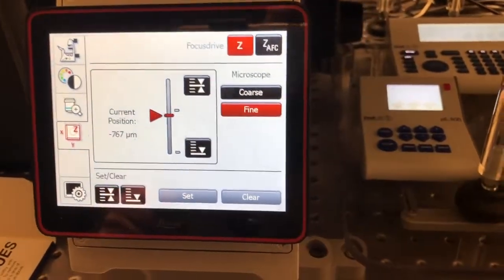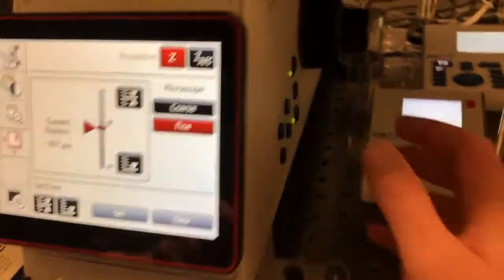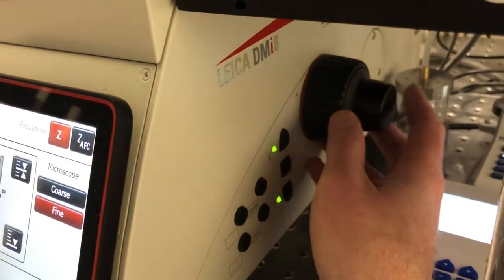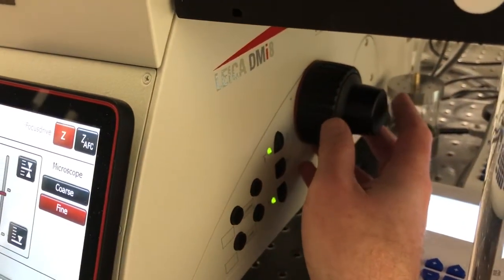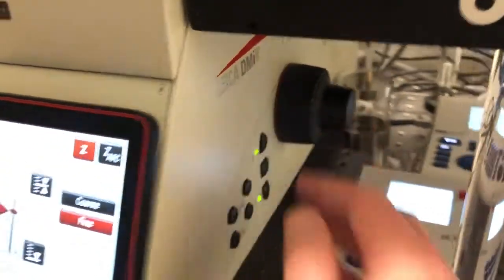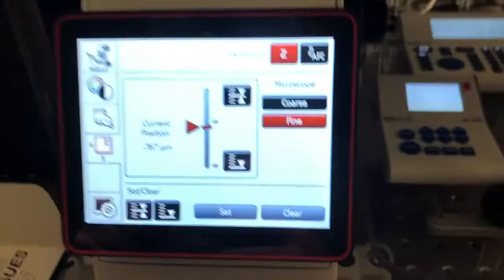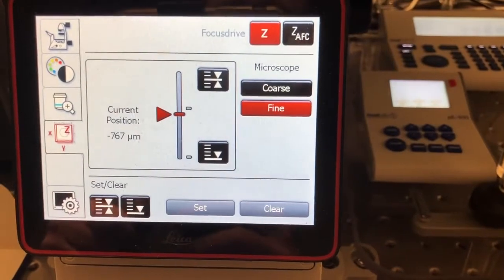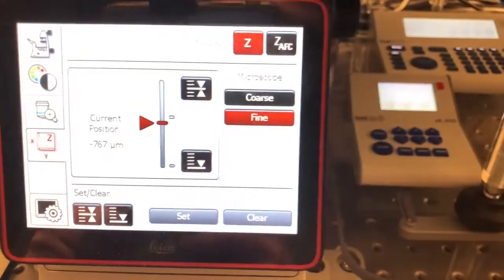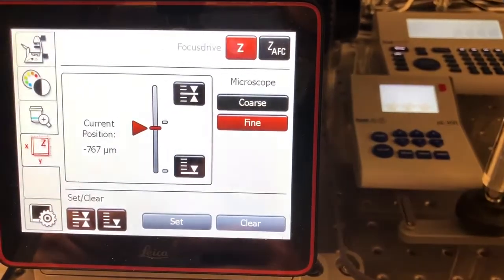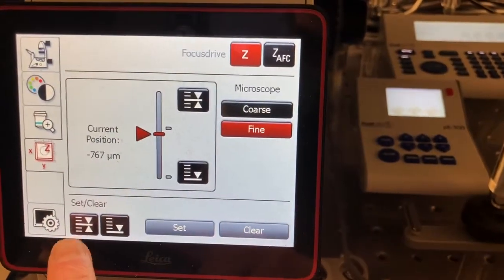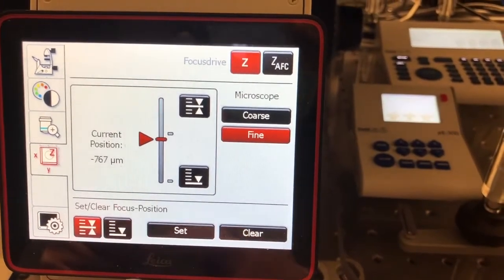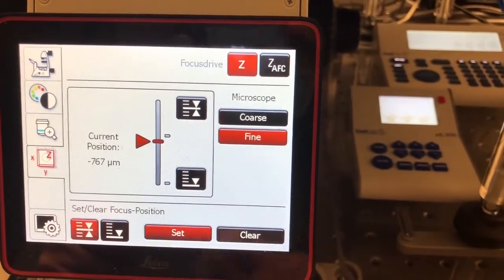Now let's say we've moved the focus knobs until we have found a sample and it's in focus. In that case, what we will want is to set this position as our new working position on the microscope, which we will do by pressing this button and then this set button.